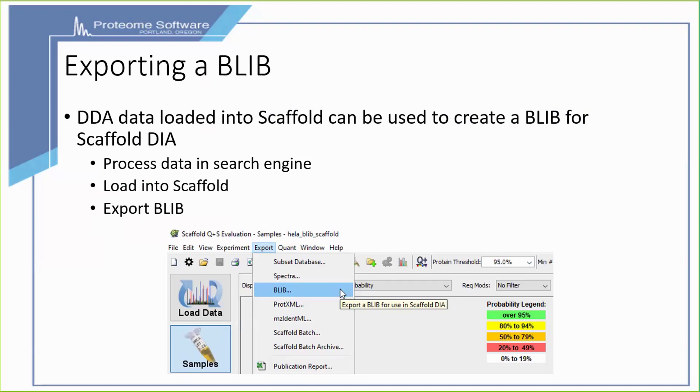A BiblioSpec library is available as an export from Scaffold. You would load your DDA data into a search engine of your choice, process it and load it into Scaffold, and then from the export menu in Scaffold you can export a BiblioSpec library.